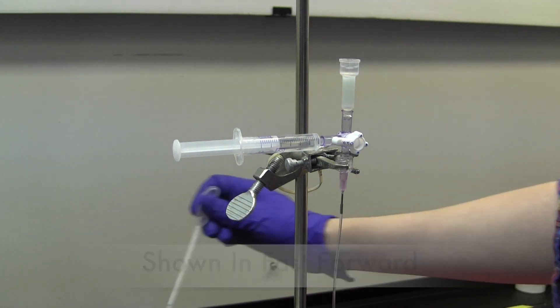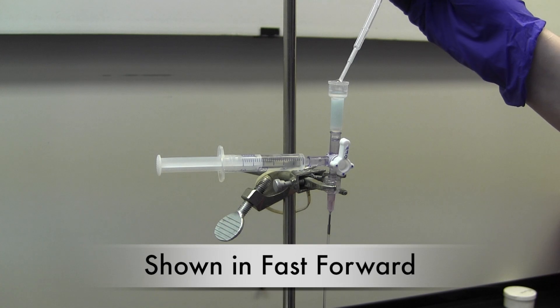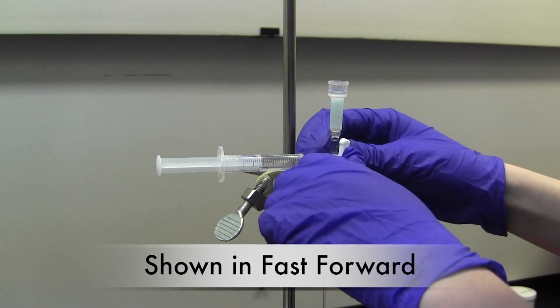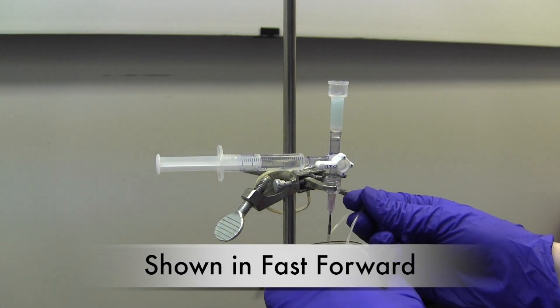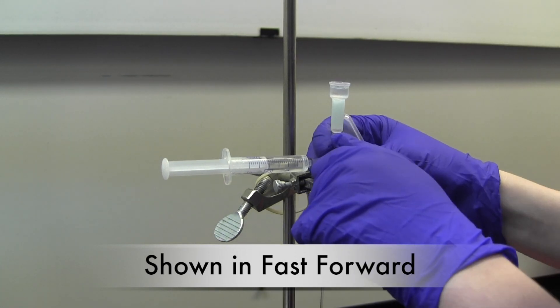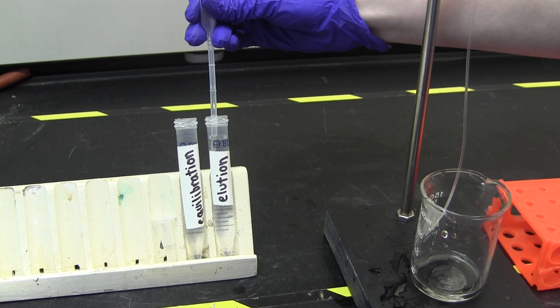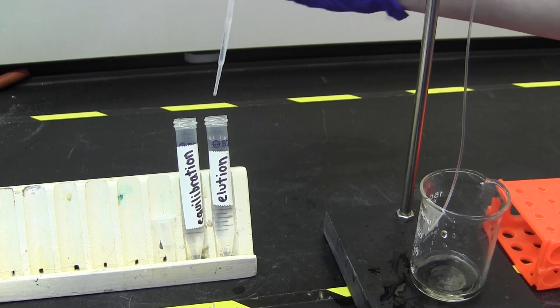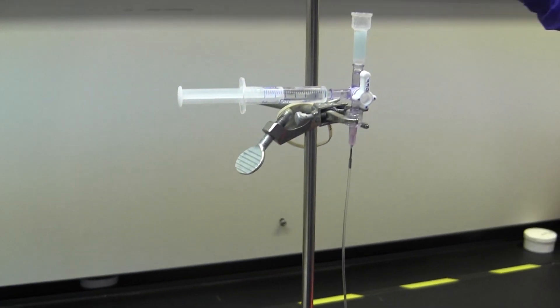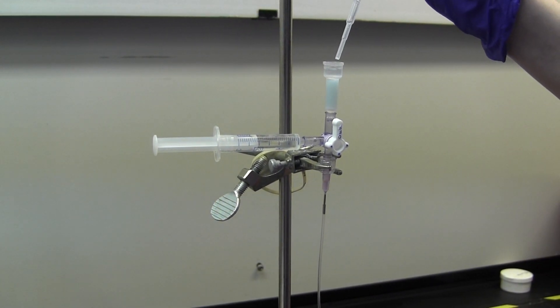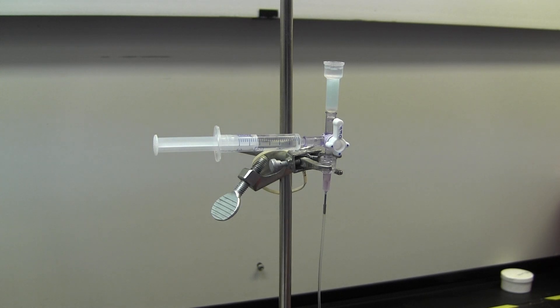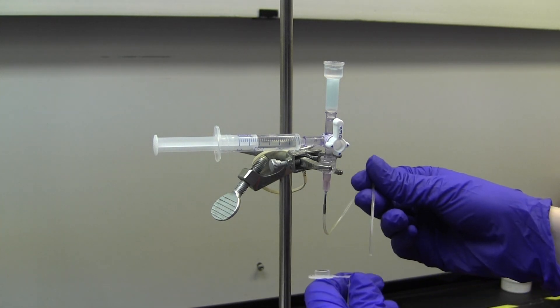Next, you will switch to using the elution buffer. Place 0.25 milliliters of buffer onto the column and let it run through slowly so it can pull off the target protein. Discard this fraction. Load another 0.5 milliliters of the buffer onto the column and discard it. Add the final 0.5 milliliters of elution buffer onto the column and collect it in a separate 1.5 milliliter bullet tube.